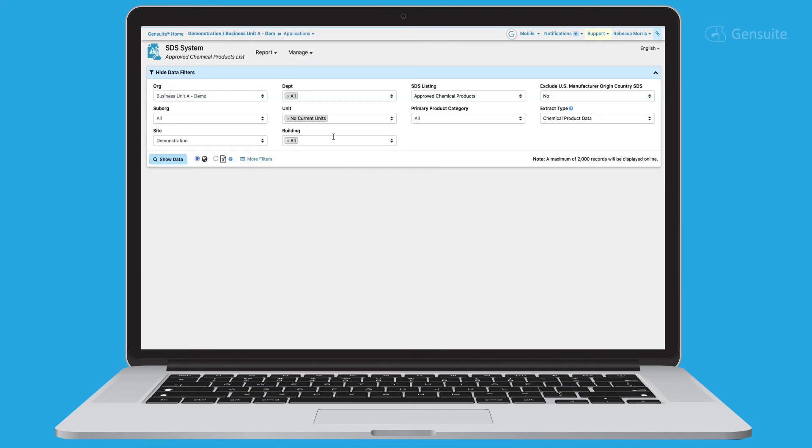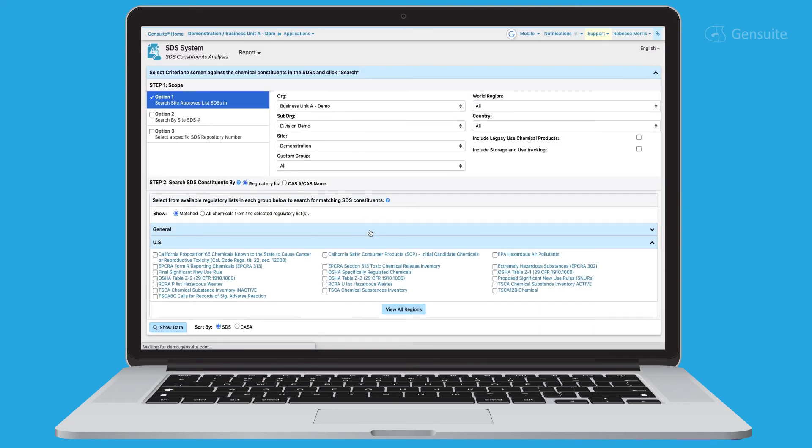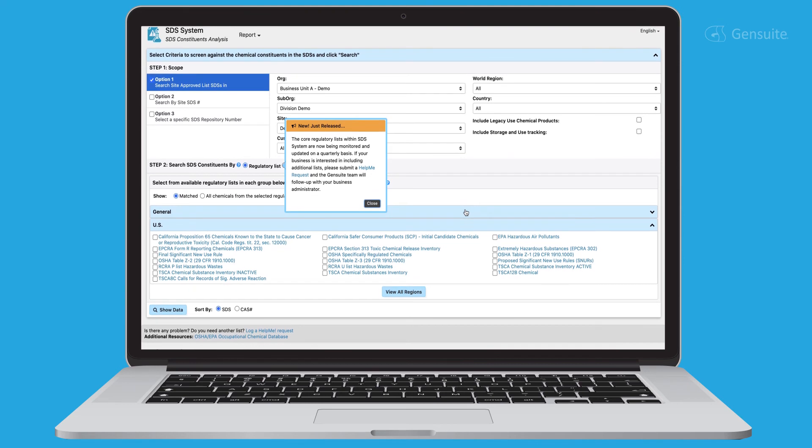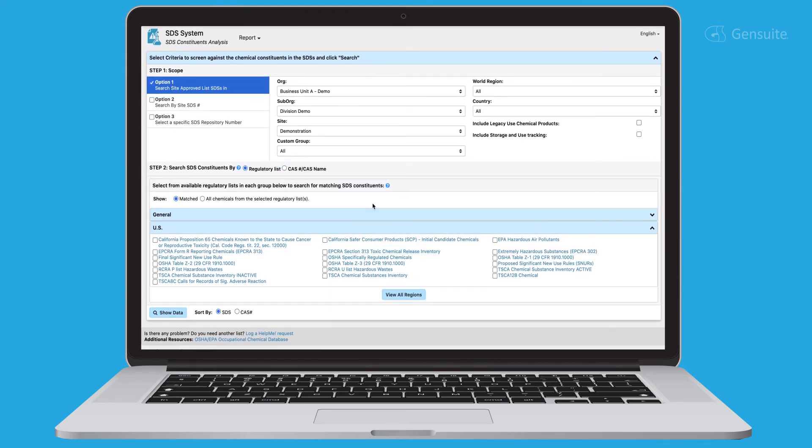SDS system is equipped with various powerful reporting and data visualization capabilities. Generate reports comparing regulatory lists with chemical products either at a business or site, or a specific constituent name or number.